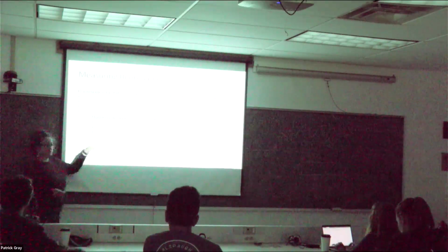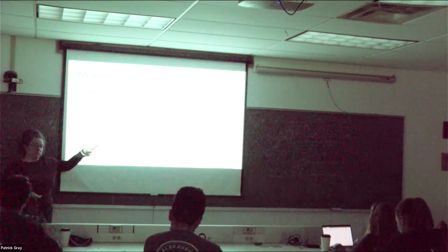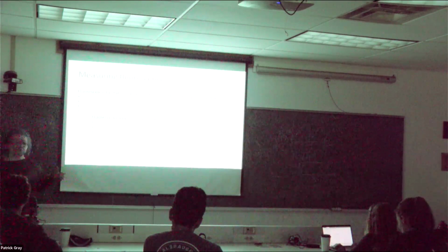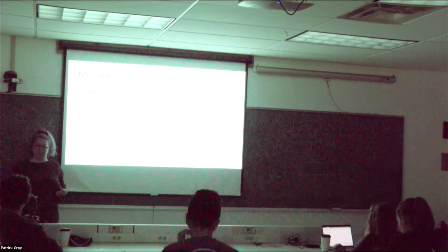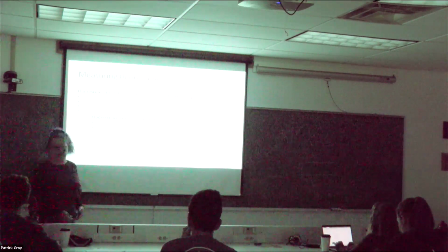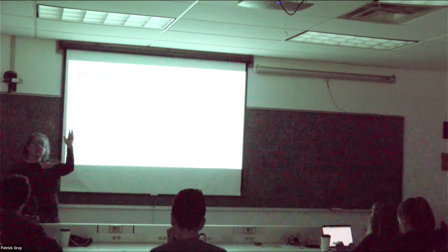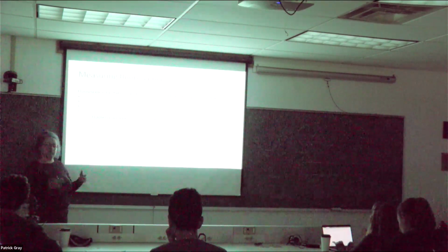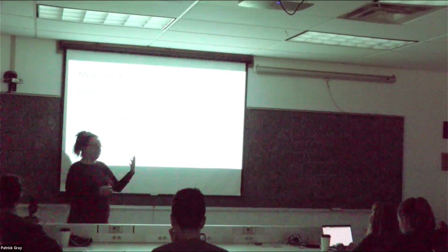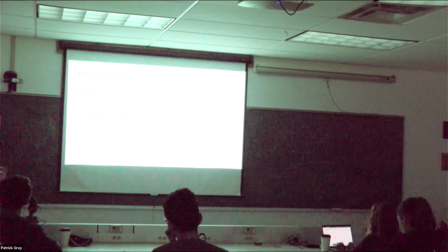You can combine these two, and I'm going to show you what you would use this for. It's really useful when you're analyzing one molecule. It's also really good to combine when you're measuring CDOM, and I'll show you how. When you have a pile of things in there, you have no idea what they are. But you can develop these matrices that can help you differentiate different types of CDOM inside, because each of them is going to have a different emission excitation pair. Just bear with me now.